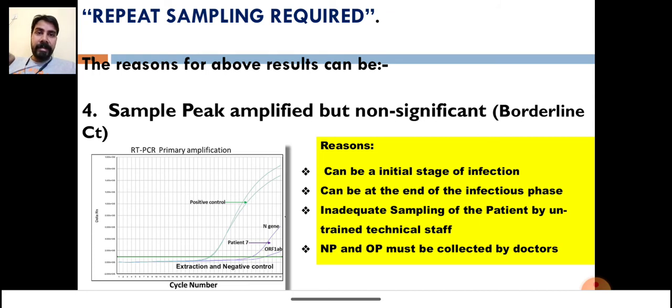The last reason is a very important reason for repeat sampling: sample peak amplified but not significant. This means IC amplified, but the sample peak—the COVID peak, the COVID genes which we are using to identify whether the patient is positive or negative—are amplified but not significant.